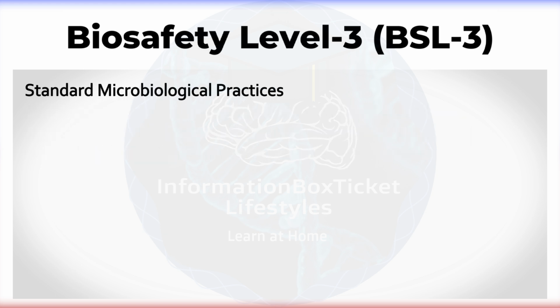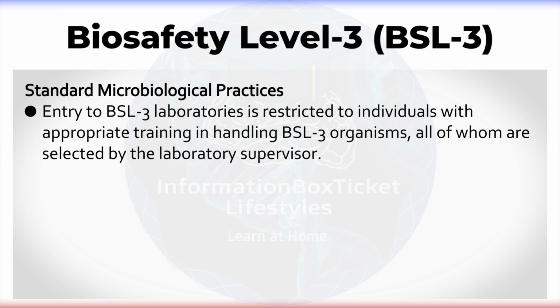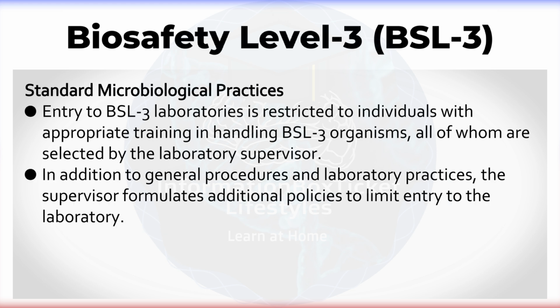Standard microbiological practices. Entry to BSL-3 laboratories is restricted to individuals with appropriate training in handling BSL-3 organisms, all of whom are selected by the laboratory supervisor. In addition to general procedures and laboratory practices, the supervisor formulates additional policies to limit entry to the laboratory.